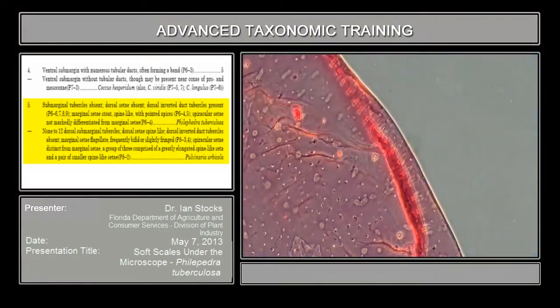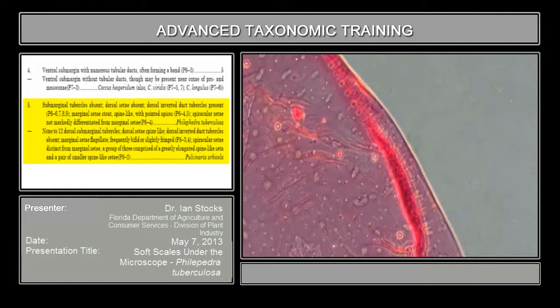There we go. Okay. So we're right here. They're going to be fairly prominent at this kind of magnification, really just disc-looking structures.